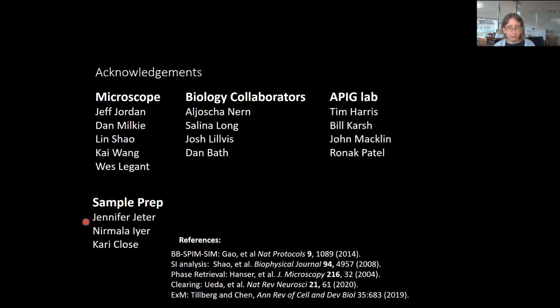That's easy to do in wide field. It's a more complicated calculation, and the current code and algorithm doesn't account for things like the illumination being confocal. So I test objectives in wide field, and I test optical systems. When I build lattice light sheet microscopes, I do the testing of the aberrations using wide field illumination, so that I can see what the detection objective is doing independent of the excitation.